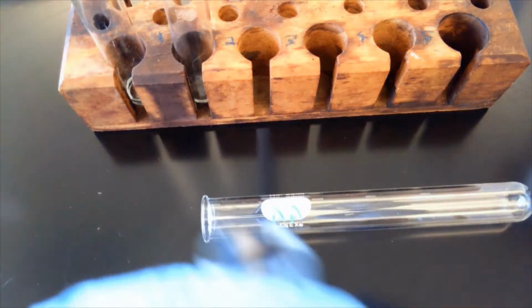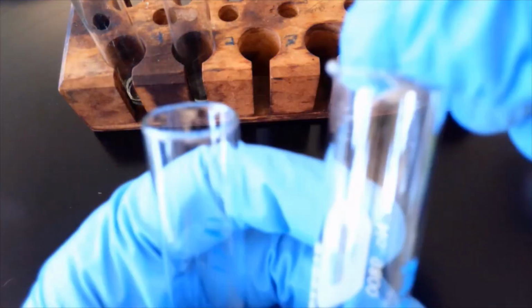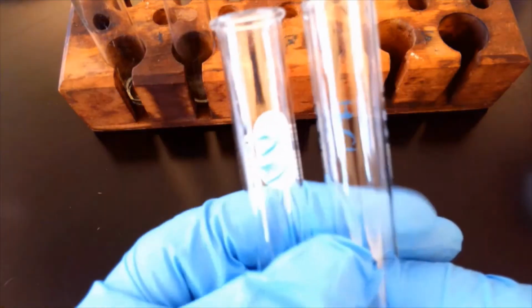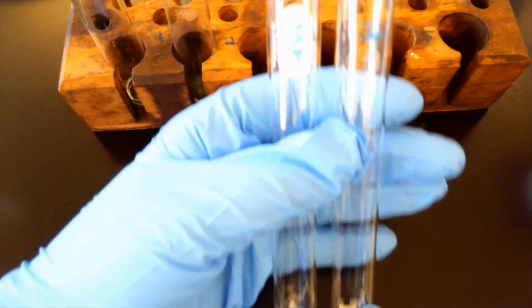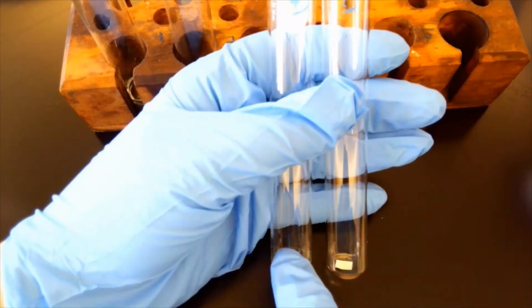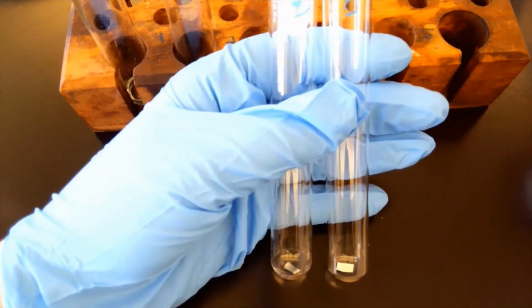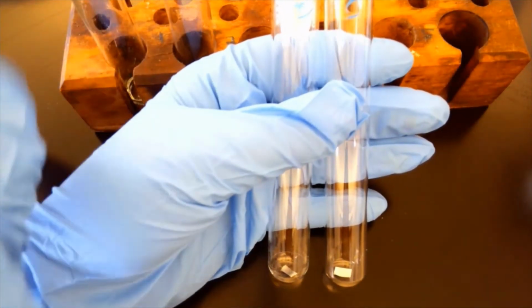And we're going to put them in. There goes one. Here goes the other. So I have 2 pieces in. I'm going to orient them the right way. And so I have HCl here, and, sorry, hope that you can see it, HCl here and the acetic acid in this one. And this is with magnesium ribbon. So let's add that acetic acid first.